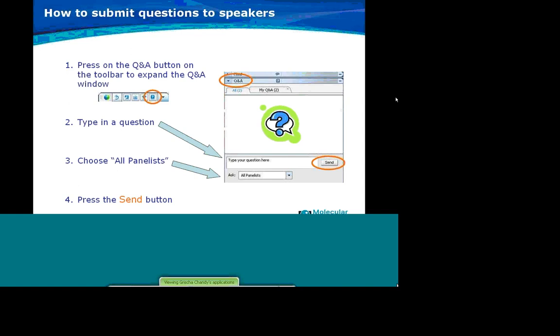Somebody asked, was there any advantage of running this assay with the confocal? We actually were able to validate and run the assay on a wide field imaging platform, the ArrayScan VTI. So, no, I really don't think that the confocal was required. But that being said, it ran very well on the confocal platform.